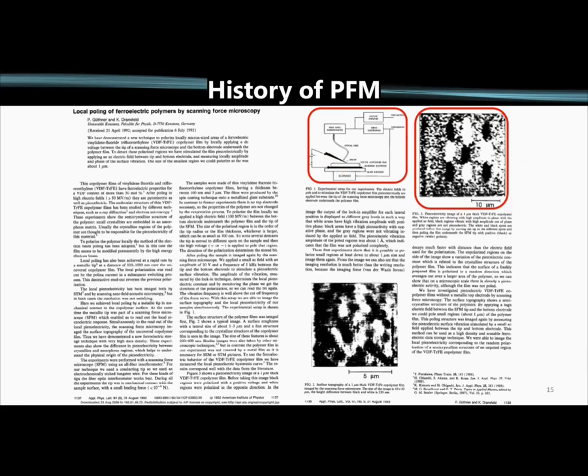And so this is really the first PFM paper kind of as we see it now. It has all the same components of modern day PFM that we do, including local ferroelectric loop switching. So it's really nice. I think it's highlighted over here. The local piezoelectricity has been measured by other techniques, but the resolution wasn't satisfying, and so they implemented this mode.